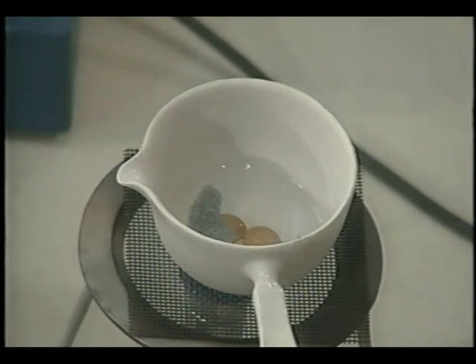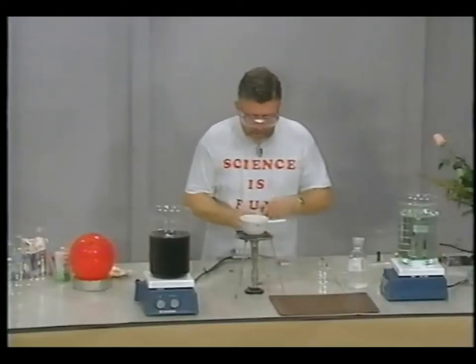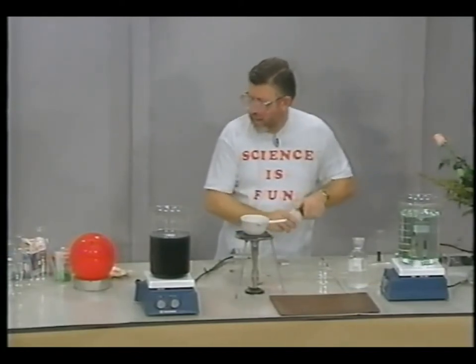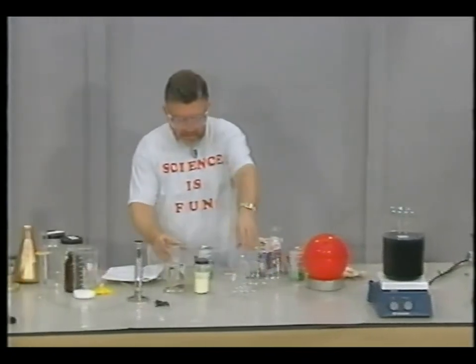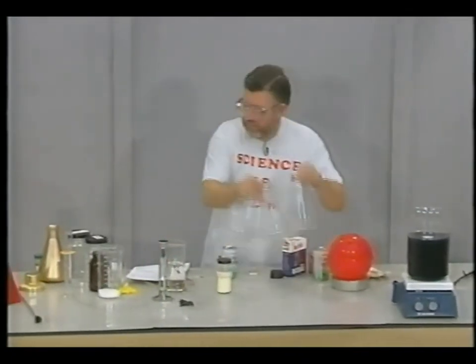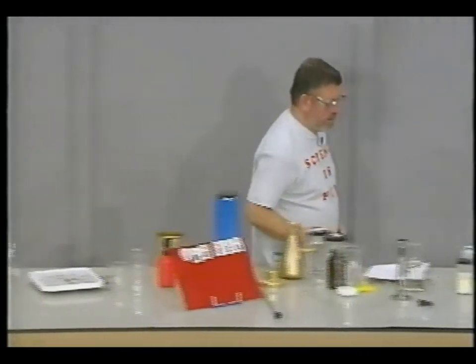Let me add a little bit more zinc here. So we have enough zinc covering all the copper pennies. So this is going to take a while to do, and as this is happening, I'd like to show you still another set of properties of liquids as the copper pennies are cooking.